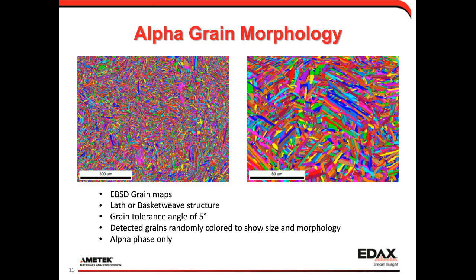Since 98% of the measurements are the hexagonal alpha phase, we group orientations as grains using a defined grain tolerance angle of five degrees — if the misorientation between one pixel and the next is below that tolerance, those pixels are clustered as grains. Grains are randomly colored to show size, shape, and morphology. While previously colors indicated orientations, here they're random but give an idea of grain appearance. We can see a nice lathy, basket-weave-type structure at both scales of the microstructure, and it appears pretty homogeneous over the larger area.